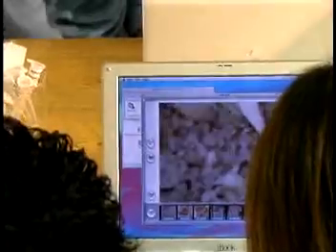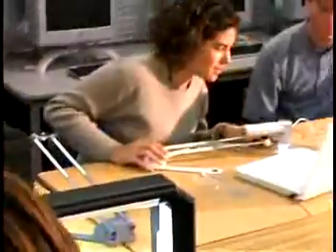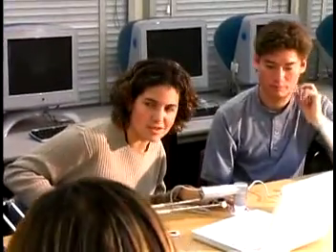This looks like a piece of shell. Yes, it is. Mr. Schmidt, can you tell which species of sea urchin it is just by looking at the spine? Sometimes you can.